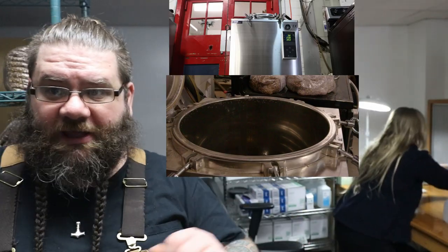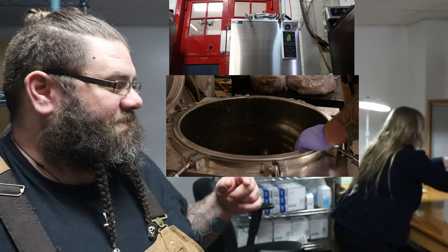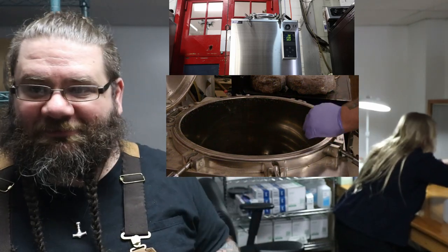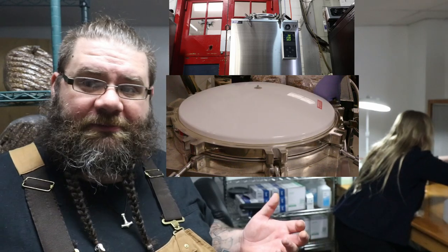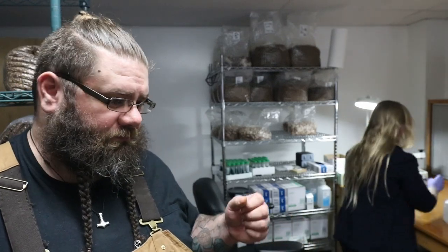And then we have autoclaves. The autoclave that we have is a 150-liter model from SH Scientific. I highly recommend you buy it from Mushroom Media Online. Seth has got a great relationship with them and can get you quick shipping and usually the best price. So, let's just check out these three really quick, shall we?